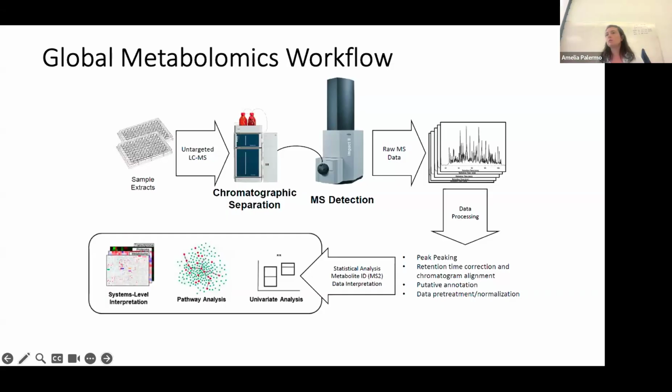But at this point, we need to start understanding if we can annotate some of those molecules. That is called putative annotation because it's not an identification, it's matching the measured m/z value with databases of expected values for known molecules. Depending on the accuracy of your mass spec, and to some extent also the resolution, but mostly the accuracy, that matching of the measured versus the database value can give you, in a typical experiment, and it depends a lot on the molecule too, for the common ones from 5 to 20 to more than 20 annotations.